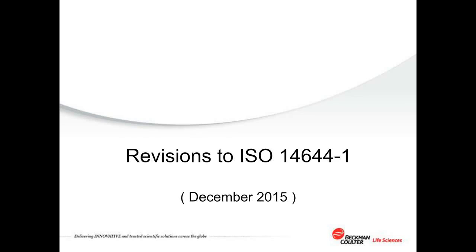It is important to recall, too, from the standard, there is no need to actually sample a cubic meter according to ISO. There may be other reasons to do that for other types of classifications, but in ISO, it's a matter of resolving the counts that you've taken to the equivalent counts per cubic meter. It's not demanding that a full cubic meter be taken.